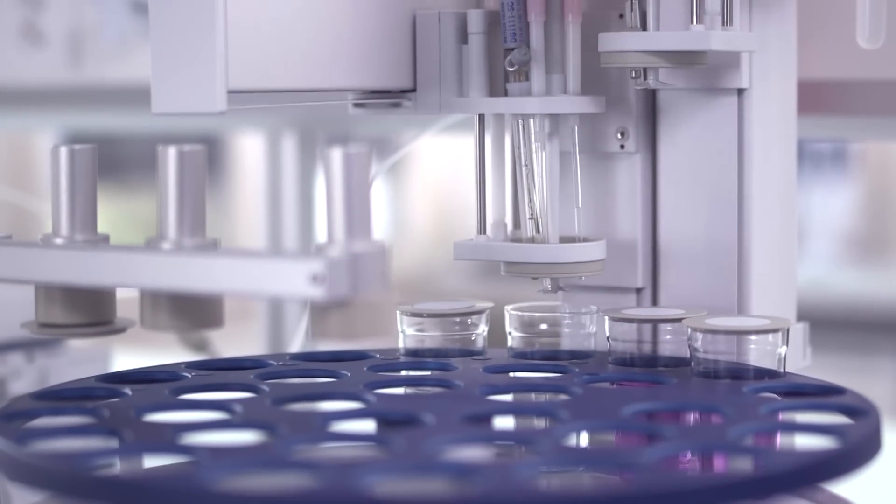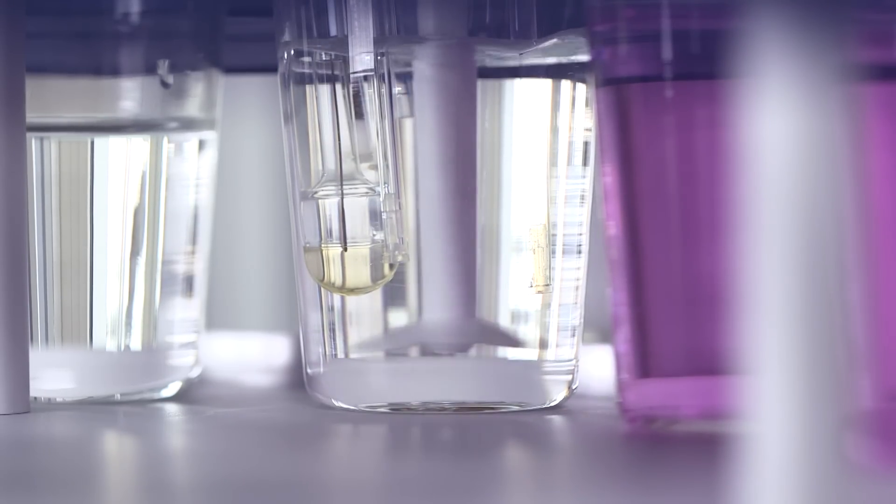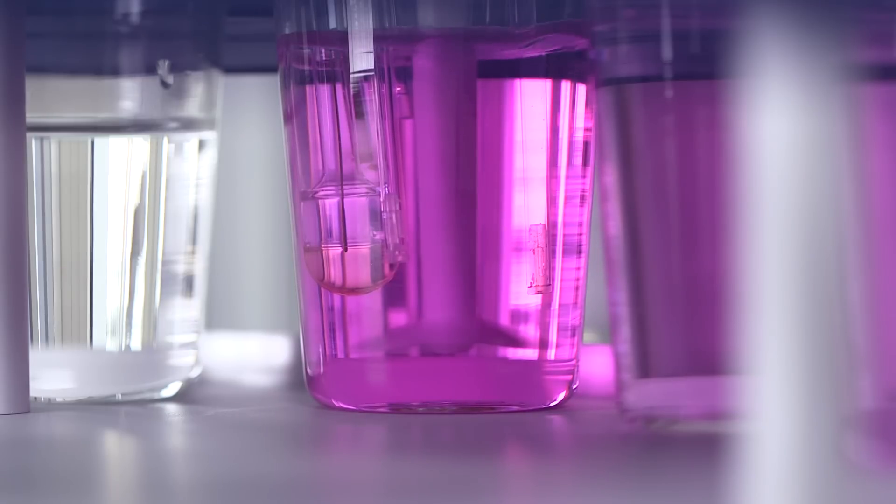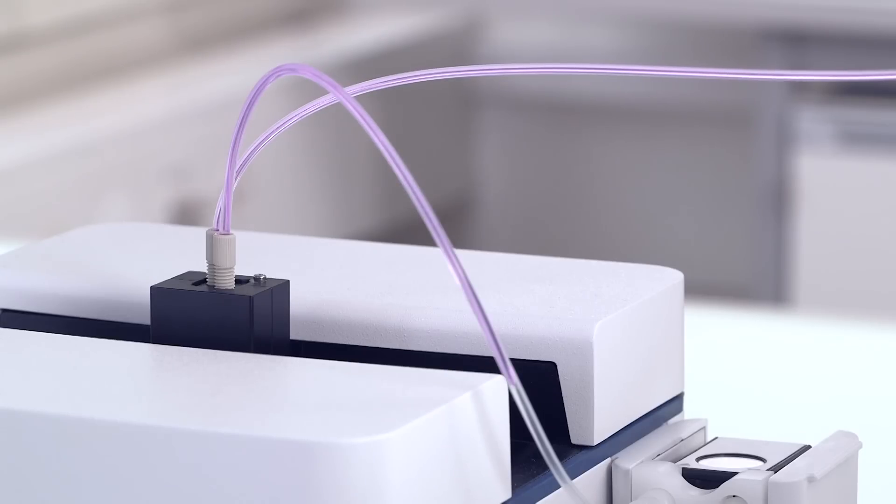Titration can be combined with other Mettler Toledo analytical instruments such as density meters, refractometers and UV-Vis spectrophotometers. This automation optimizes accuracy and reproducibility while saving valuable time.